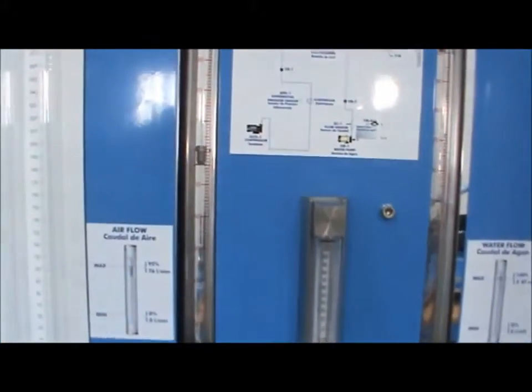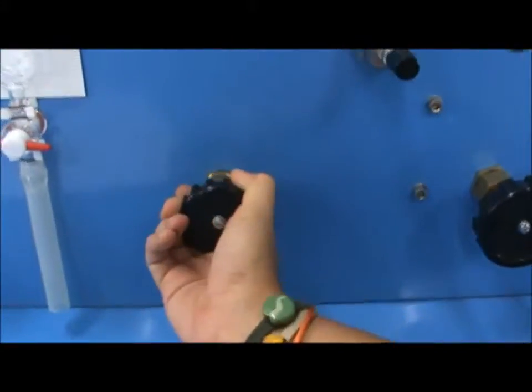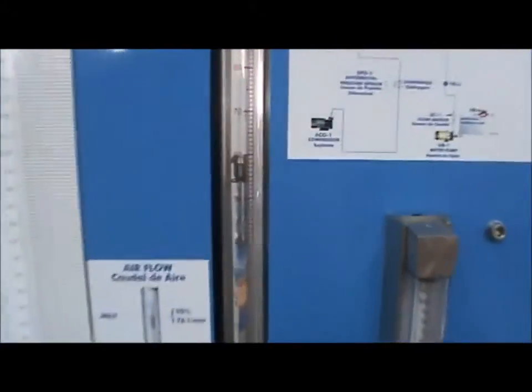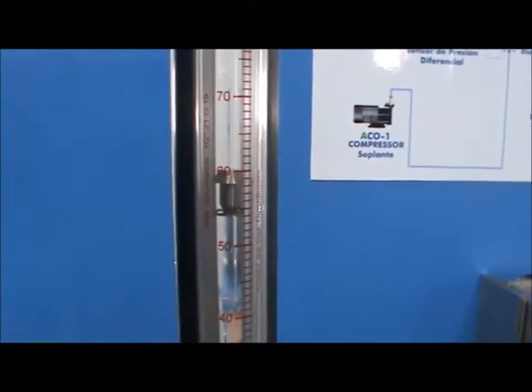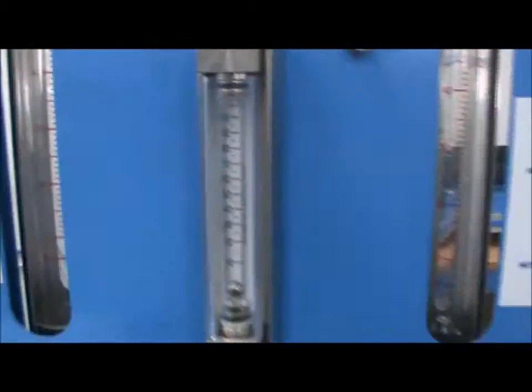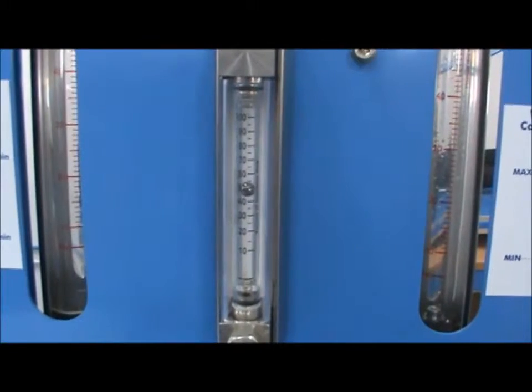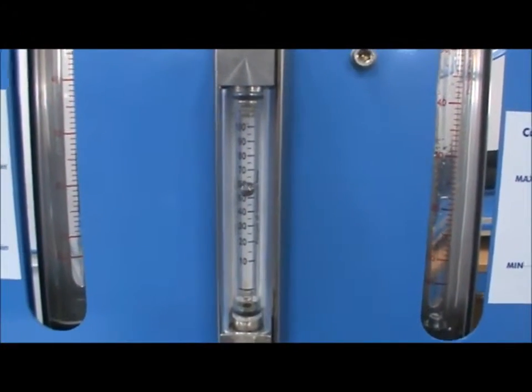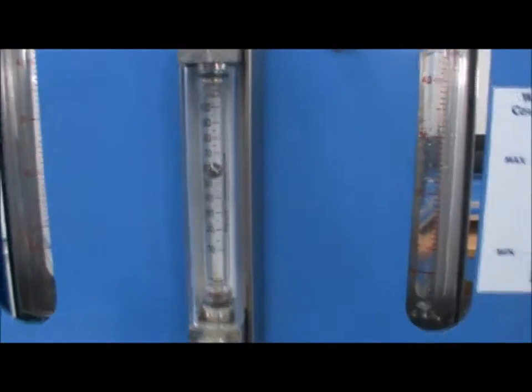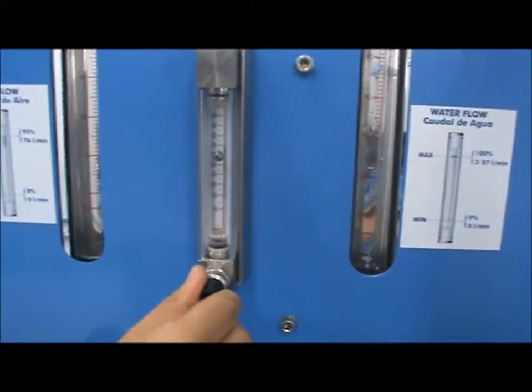Turn on the airflow by activating the pump using the software, and adjust the flow to the desired value, 60% for example. Next, open the CO2 tank providing one bar of pressure to the unit, and adjust the flow as needed. In this experiment, we will use 40%.